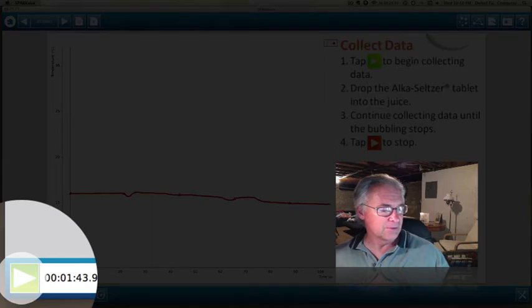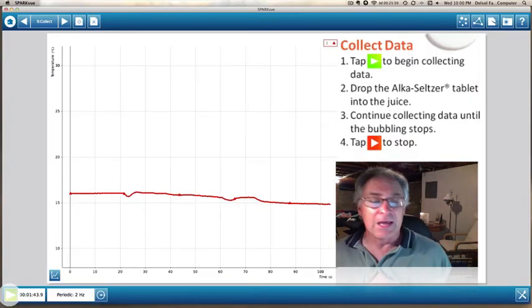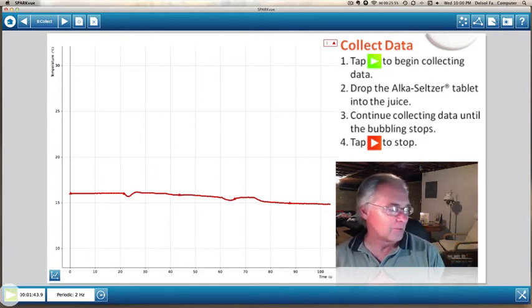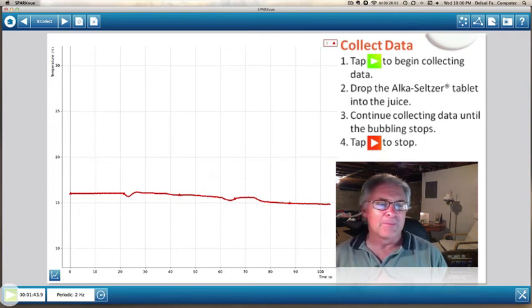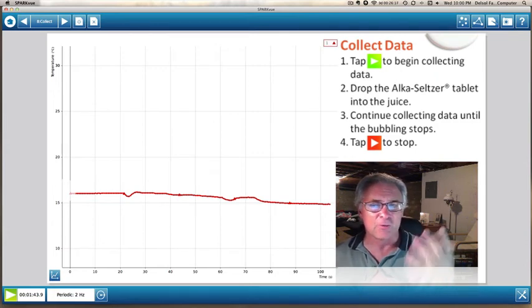All right. That's good. I'm going to make sure it doesn't go over on the desk here. And now, what you're going to be looking is, if you look at what I've got here, it doesn't look terribly exciting. You notice it's pretty much a straight line. Maybe it's dropped a little bit. But we have to scale it. If you notice right here, along the y-axis, you have 15 degrees Celsius to 20 degrees Celsius. We're talking about temperature difference in the tenths of a degree. So that's scaled way too much.